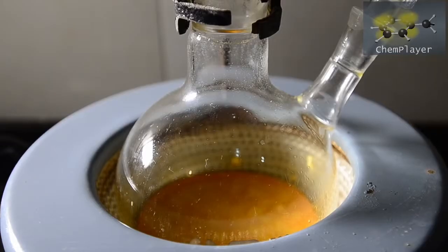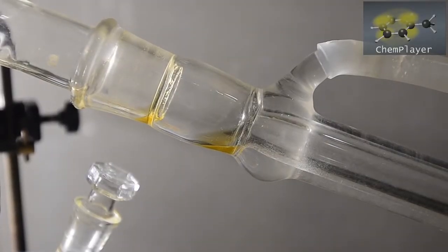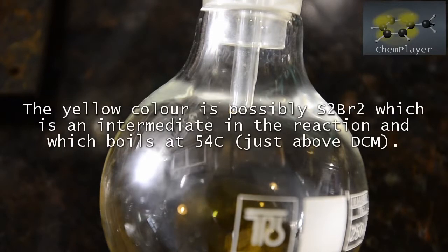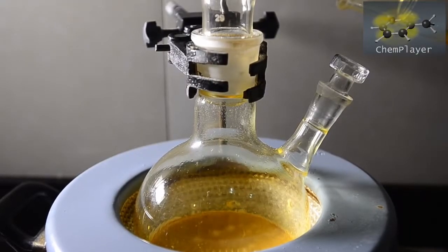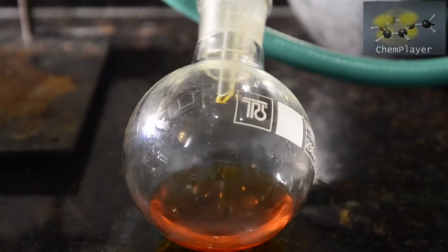First to come off was the dichloromethane solvent, originally from the bromine solution we added, although it's distilling with a yellow color. It's possible that we've got some unreacted disulfur dibromide, our intermediate, coming off as well. Distillation of the DCM at around 45 degrees continues, and the temperature slowly increases. As it does so, the color of the distillate changes and becomes quite a dark orange color.